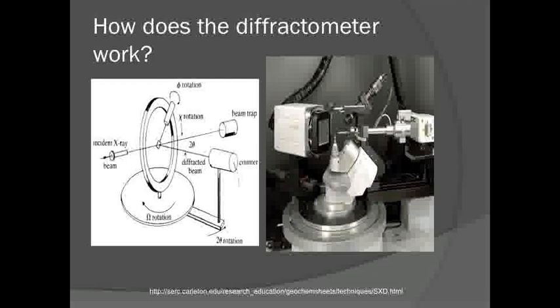Say we have a cathode ray tube that produces X-rays. Cathode ray tubes work on the principle of heating a filament to produce a beam of electrons. These electrons are accelerated to a target by the use of an applied voltage. It is when the electrons have the adequate quanta of energy to dislodge inner electrons of the target material, which is usually molybdenum, that a spectrum of X-rays is produced.